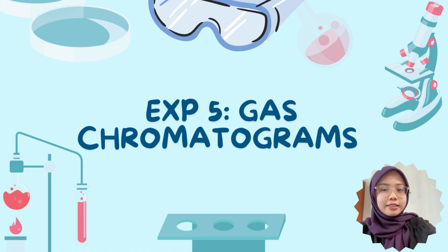We'll be presenting on gas chromatography and discussing 5 results obtained from the gas chromatography analysis.